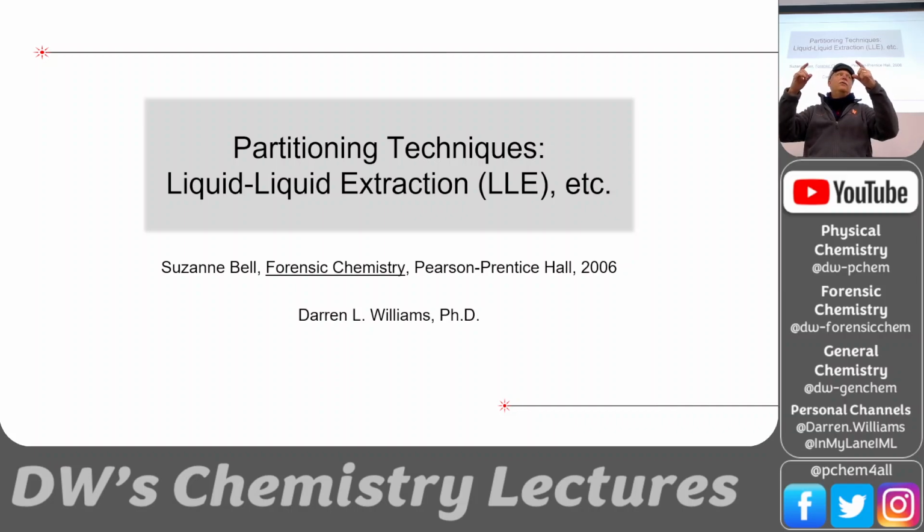Okay, so now that we can play with the pH of the aqueous phase, if we ionize something, it'll be in the aqueous phase. If we deionize that, it'll go into the organic phase, because these are organic molecules that don't really want to be in water. There's no handle on the molecule unless it's like an OH or an acid group or something, or a BH plus, to get it into water. Once we lose those handles, we protonate it or we deionize it, then it is more comfortable in the organic phase. So we can use Le Chatelier's principle to drive things into the organic phase or drive them into the aqueous phase. So that's what today's topic is.